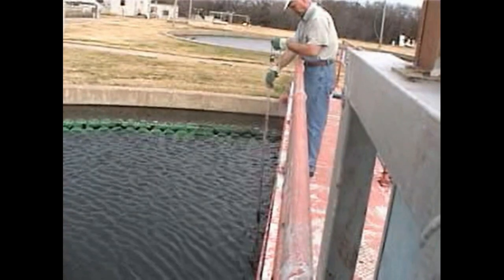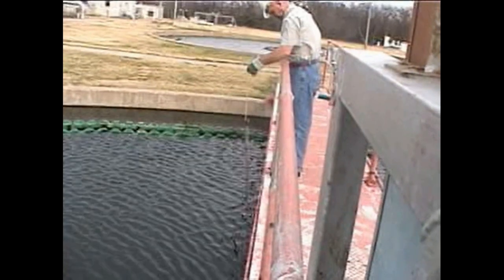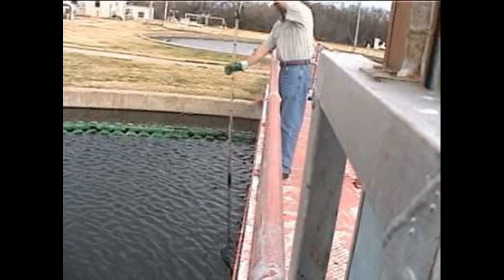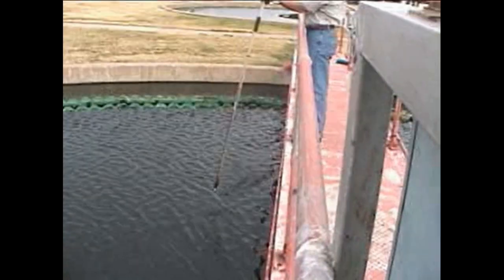What we're seeing here is going to be four different measurements. The first one is a very slow approach to lowering it down into the tank. And believe it or not, when you buy a sludge judge, they don't come with instructions, because I've purchased one and there were no instructions to be found. But basically what you have is this clear plastic tube with a floating ball valve down here at the very end with that little white pin sticking out. And that ball valve rests in a nest, which causes a constriction of the internal diameter of that sludge judge.